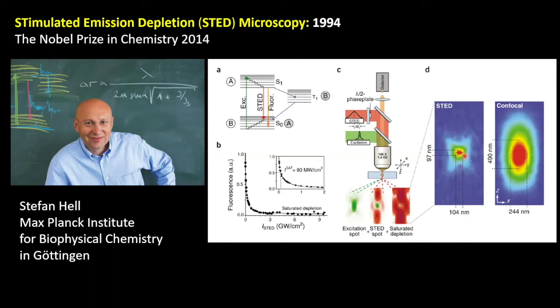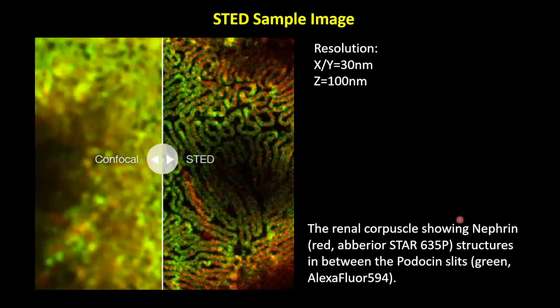So this is a so-called STED image. For example, with conventional confocal, the light spot becomes a large pattern of this size. For X and Y it's about 250 nanometers, and for Z it's about 500. However, because the STED laser quenches the light on the outside, you're left with only the center light, and therefore you achieve a much higher resolution. And here is one example, confocal with STED. With the technology advancement, the current STED can resolve XY up to 30 nanometers and Z about 100 nanometers.